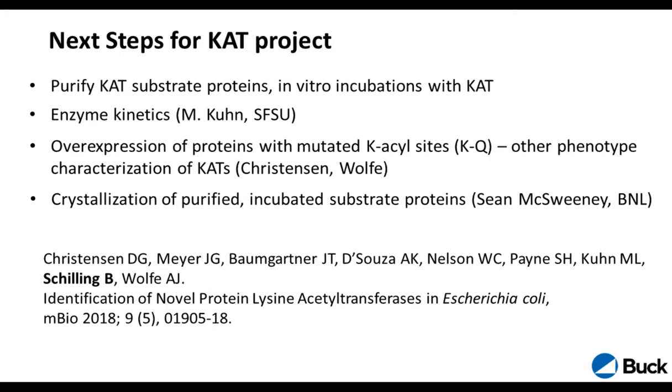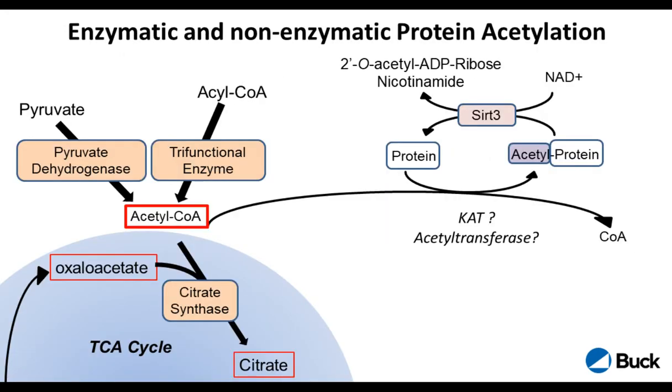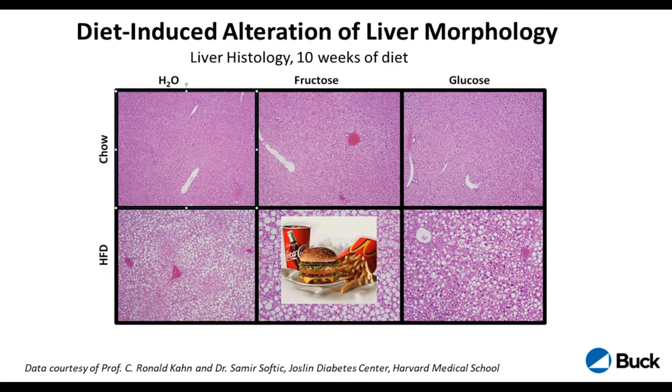As a second part, I'd love to show you some data that we did in mice. So these antibodies also work really well in mice. So we have acetyl-CoA, and you can now imagine using this acetyl-CoA to either chemically acetylate or also use acetyltransferases in these mammalian systems. The systems we were looking at were actually kind of interesting.